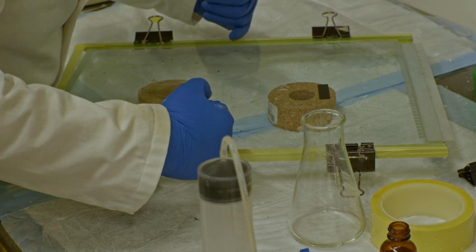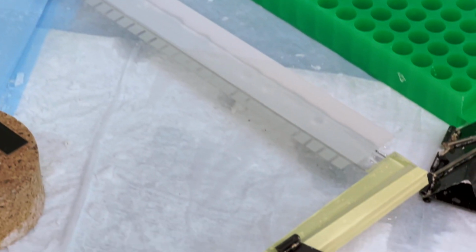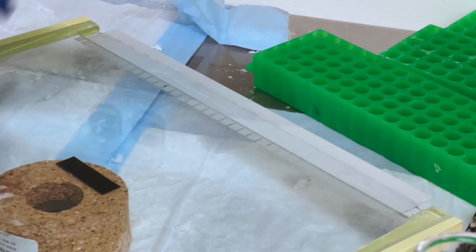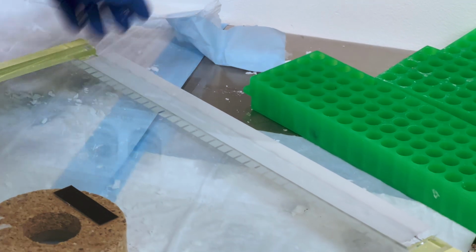So I'm going to run my gel halfway through, and as I'm visually inspecting it, I see no bubbles here. I see no bubbles in the wells, which is fantastic. I can tell that my gel is going to be set nicely. This will take about an hour max.